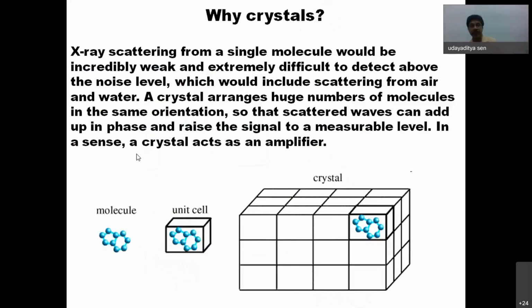Okay, so why do you need a crystal? Basically, when X-ray falls on an atom in the crystal, it interacts with the electrons of the atom. We all know that protein is made of carbon, nitrogen, and oxygen, and sometimes sulfur or some metal ion. But by and large, the atoms are all low molecular weight, so they have very few electrons, 6 to 8. So if we consider a single atom, the diffraction we see is very feeble.